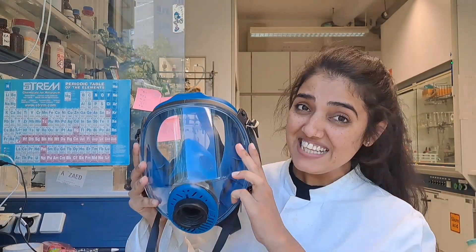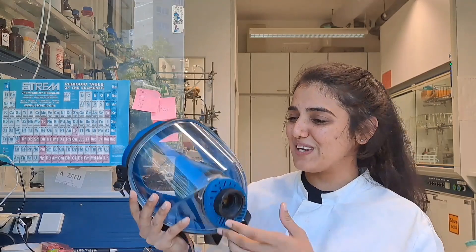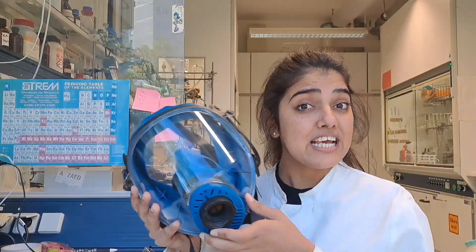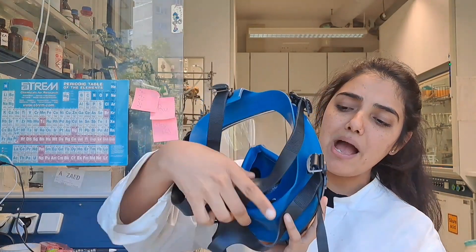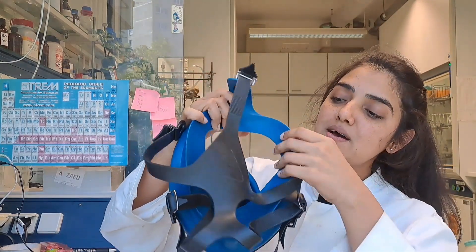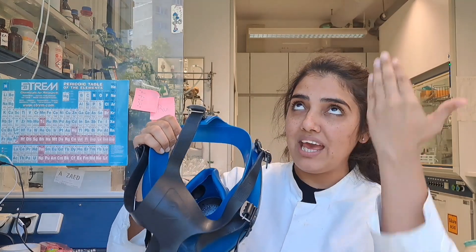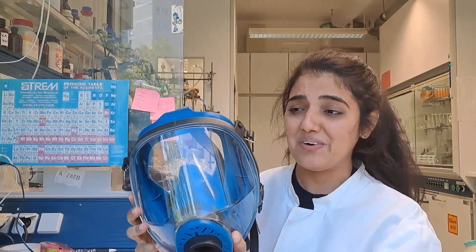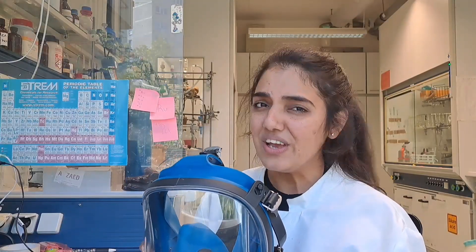So at the end, we have this full face shield. I never got the opportunity to work with this, and I don't want to, because it looks a bit scary. Such a shield is used for extremely harmful chemicals or in case of emergencies like fire. It has a special filter system for your mouth for breathing, protects your eyes, and has a vacuum seal at the back which creates a vacuum on your face to prevent any chemicals from entering. It's really very good for extremely toxic chemistry. Should I try it on? Okay, we gotta try it.